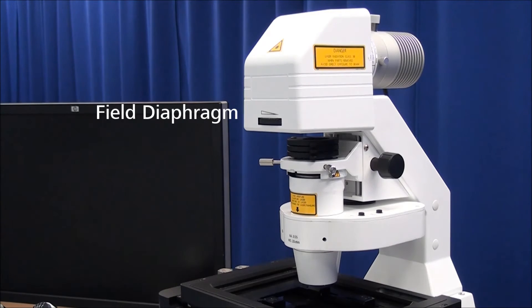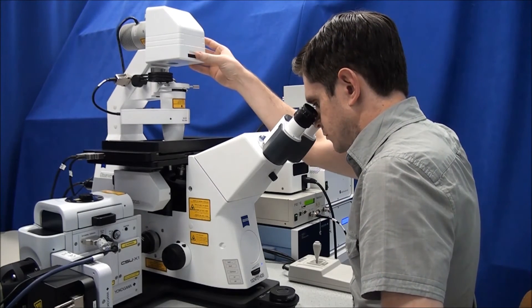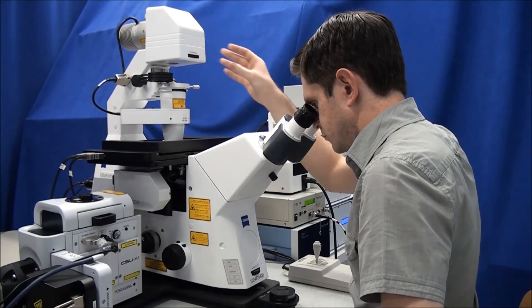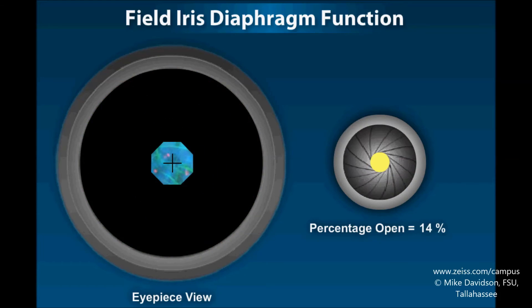Relocate the field diaphragm. While looking through the eyepieces, roll the dial to the right to close the field diaphragm until the blades, in focus or not, come into the field of view. The field diaphragm controls the beam diameter of your lighting.